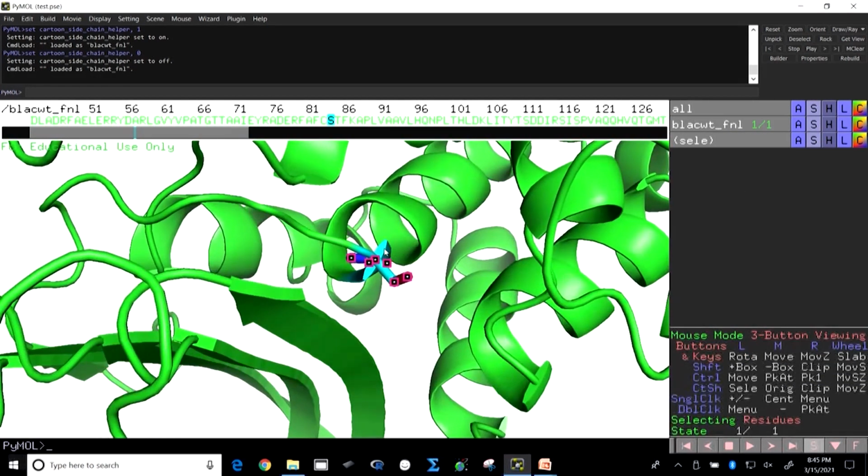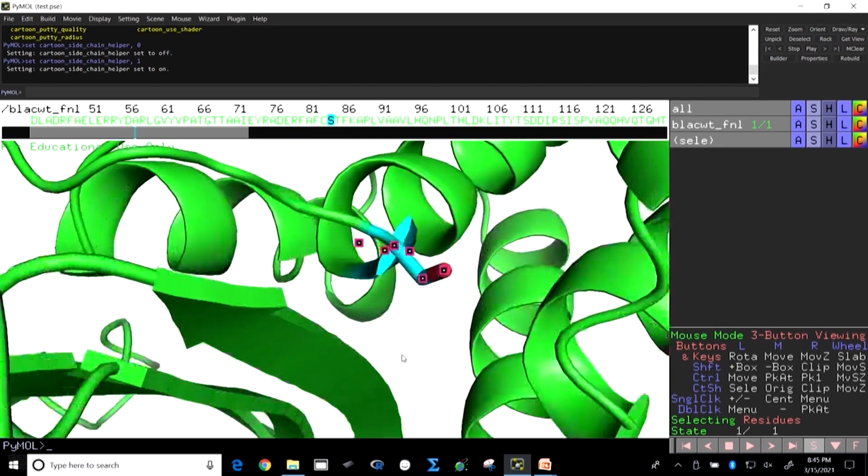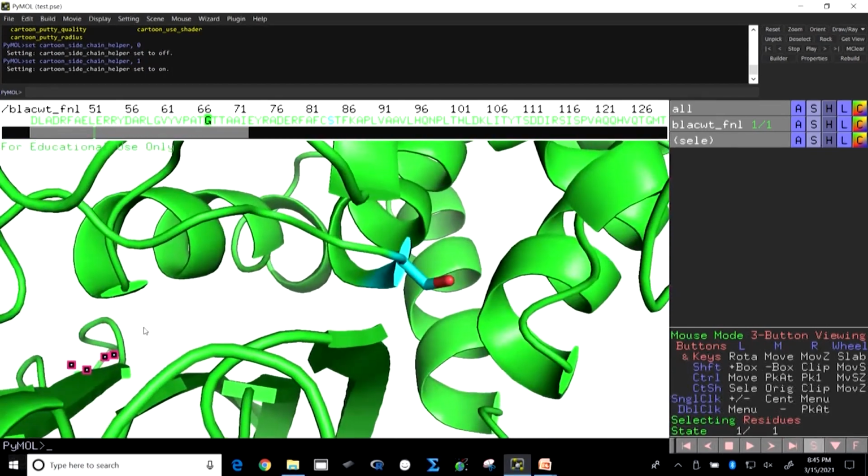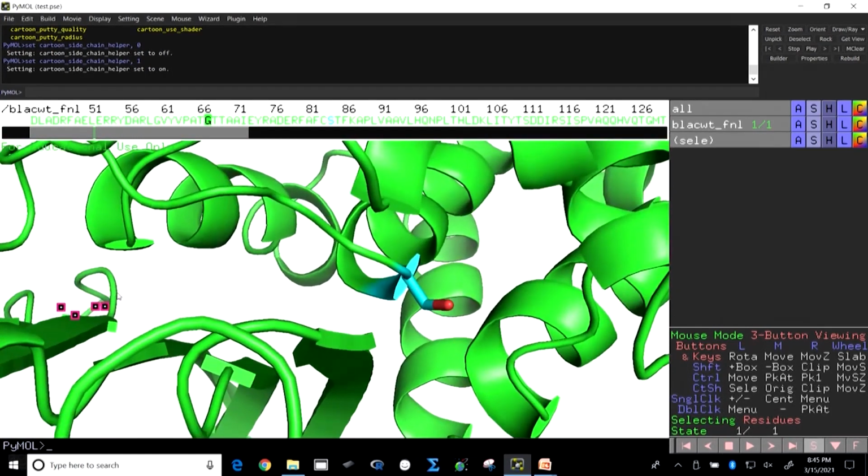Through this residue, the enzyme performs its catalytic activity, and you see that the serine is represented here, the whole enzyme is represented in cartoon format, whereas we have given a different stick format to the amino acid. This will help you to identify the amino acid, and next it will further help you to identify the interaction of this catalytic amino acid with other ones.